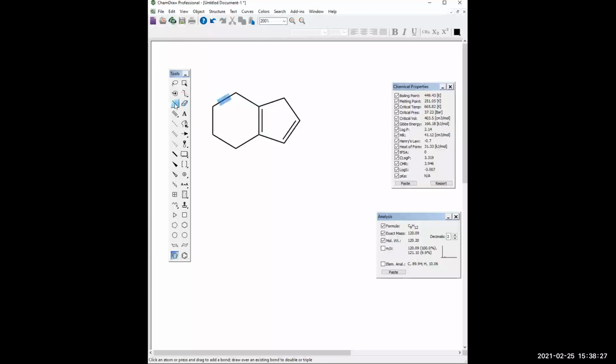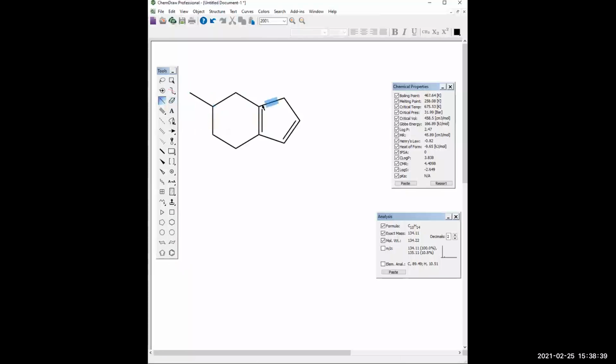So we connect this. And now I'm going to put in our single and double bonds. So we have a single bond here, 2 positions away from our intersection, and then another single bond here, single bond here. I'm sort of cheating. I have something to reference to, just magically appearing. So now we have our bonds, and I always like, just a personal preference, do our atom substitutions.